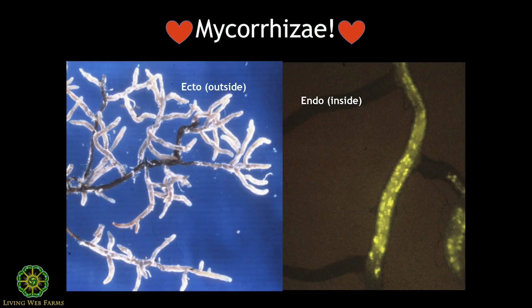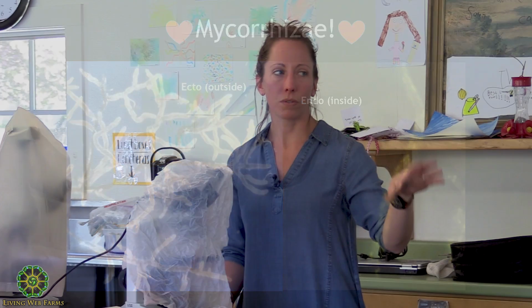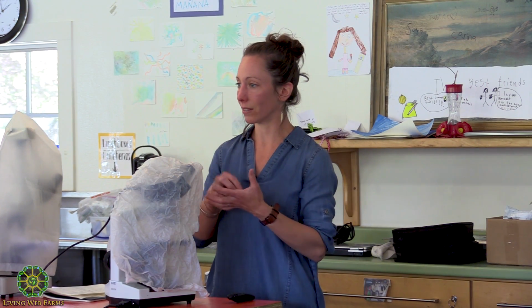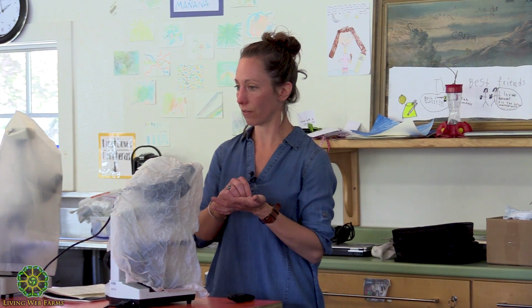the root, which you'll see on the left there. That's an ectomycorrhizal association, which is mostly on conifers, so not really typical in agricultural situations, depending on, I don't know if anybody's a forester. And then on the right, this is more common for what you'll see in agricultural crops, is endomycorrhizal association. So that's where actually the fungus will grow inside and in association with the plant root.